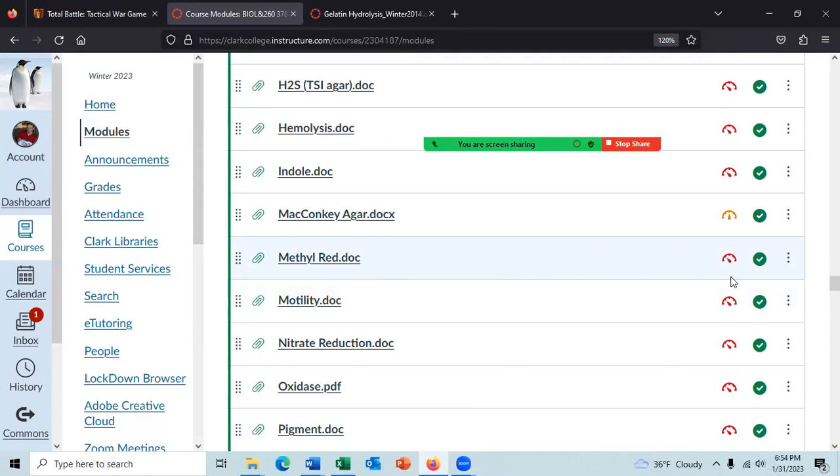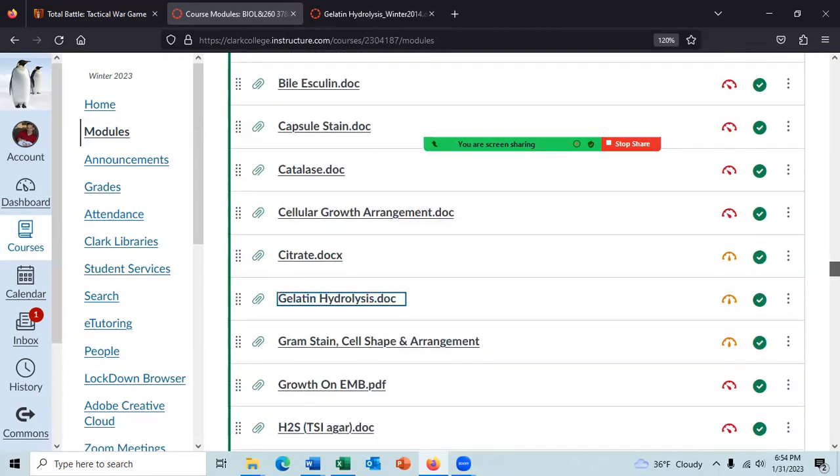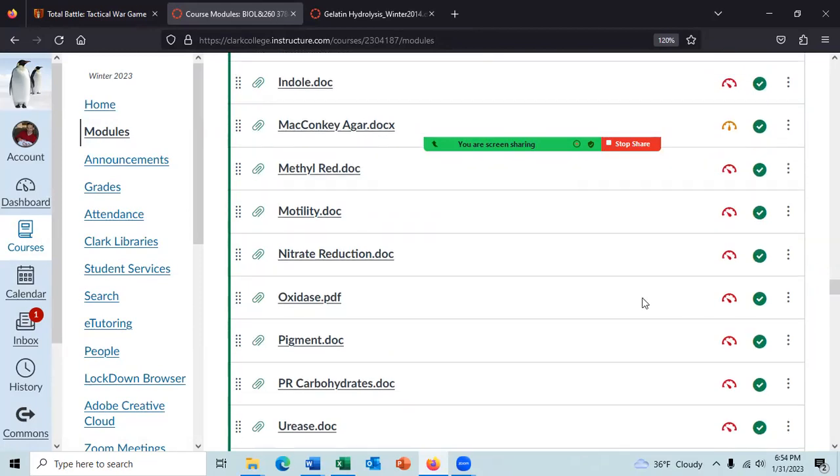There are a few that take 1 day or less. And that would be the pigment test, the oxidase test, the catalase test. For the oxidase test, if you don't have fresh growth, that will have to be grown. So you cannot get it in a day, because you'll get it in 2 days, because 1 day you have to grow your bacteria to get fresh growth, and then you run the oxidase test. But if you have fresh growth, you can get the oxidase test in 1 day, and the pigment test you can get in 1 day.